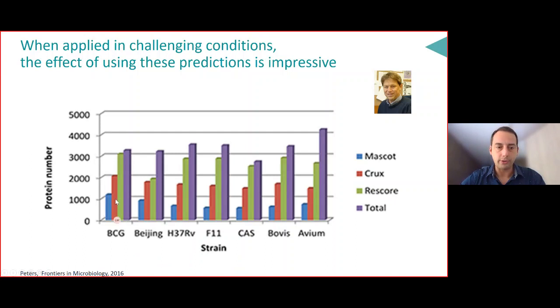So when he was searching this with normal Mascot, which is kind of the reference, even though Mascot is starting to show its age a little bit, you can see that you get a reasonable number of proteins identified, but he was not very pleased with that number. So then he tried something a little bit more fancy, which is Crux, and Crux is essentially SEQUEST plus Percolator, especially at that time. And then you can see that you can essentially double the number of identifications. So red versus blue is about double the IDs, which is really showing you the power of machine learning again, because Percolator, made by Lukas Käll, actually manages to leverage machine learning to triage the identification results into definitely good results and definitely bad results in a much more nuanced and a much more successful way, if you like.